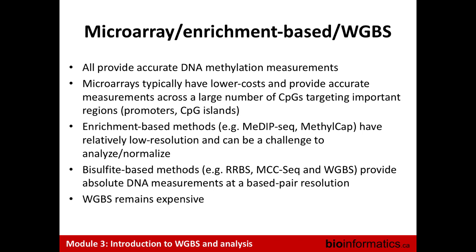I'm almost done with the broad introduction. This is the slide talking about some of the advantages and differences. At some level, all of these methods do provide methylation measurements, although, as I mentioned, the enrichment-based approaches are a little bit harder. That's what you have here.